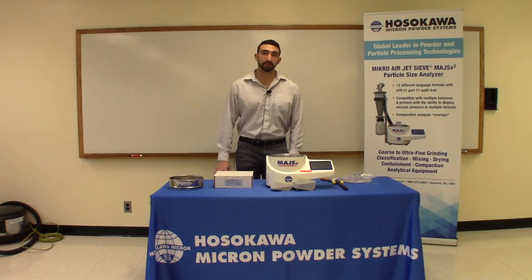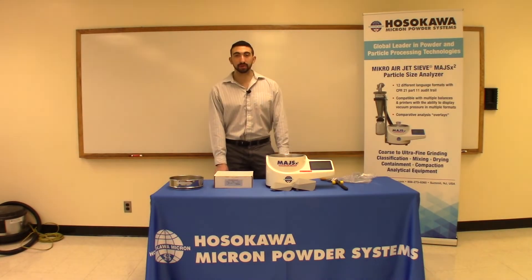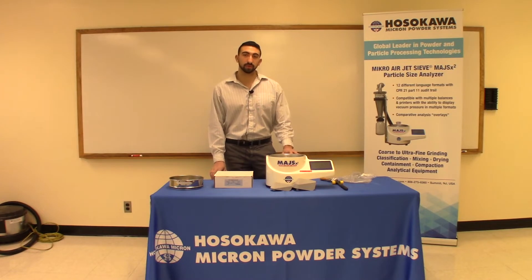Hi, my name is Trevor Corrado. I'm a product specialist here at Hosokawa Micron Powder Systems in Summit, New Jersey. Today we're going to talk about the two different size sieve screens, full height and half height, that are offered on the MAJS-X2, and then what to do with the blue gasket and black o-ring.